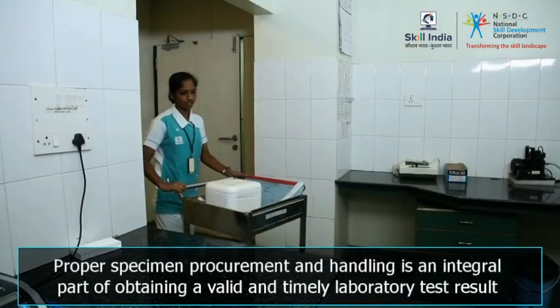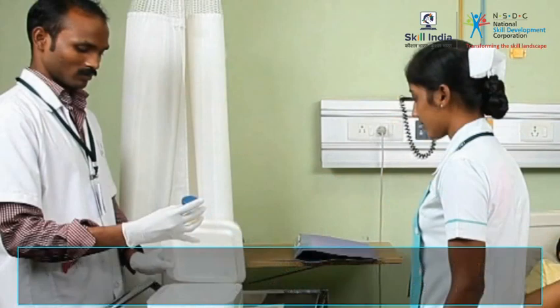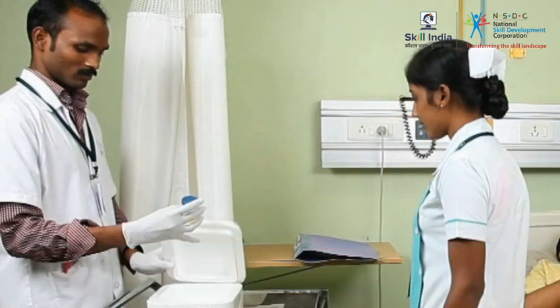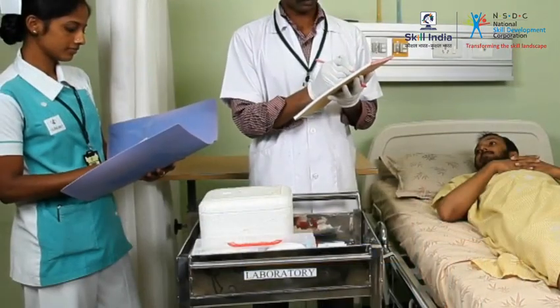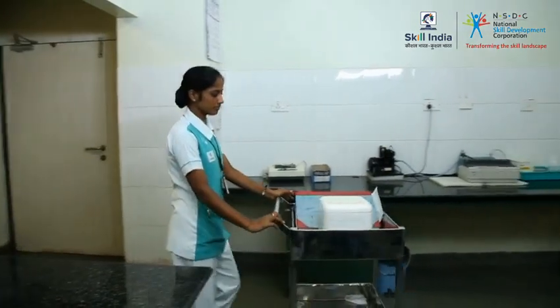Proper specimen procurement and handling is an integral part of obtaining a valid and timely laboratory test result. It is your duty to ensure that the specimens are collected properly, labeled correctly, and are promptly transported to the laboratory.